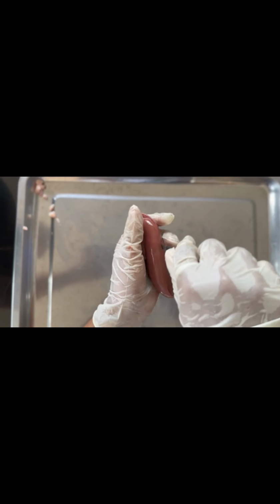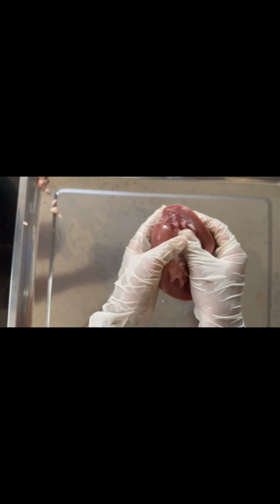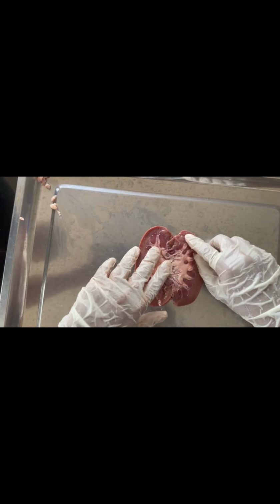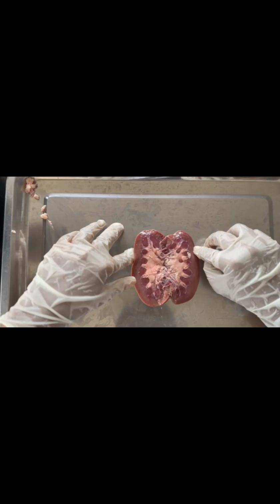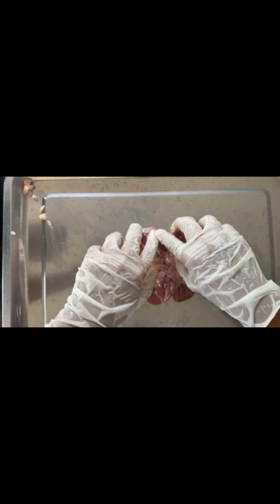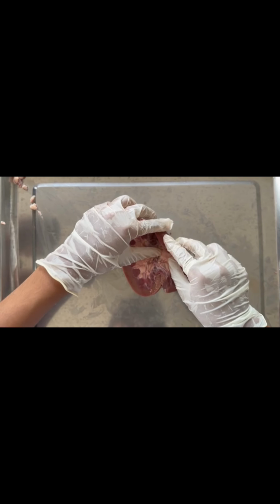Located inward from the cortex is the medulla. It includes the cone-shaped renal pyramids. These are the fibrous, striped triangular zones in the medulla that contain the collecting ducts, which collect urine from the kidney.